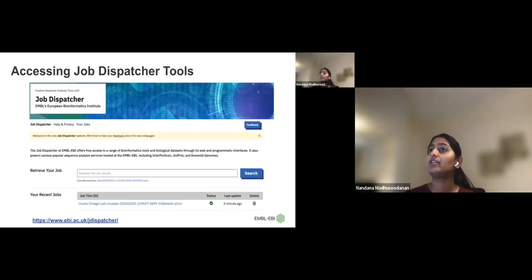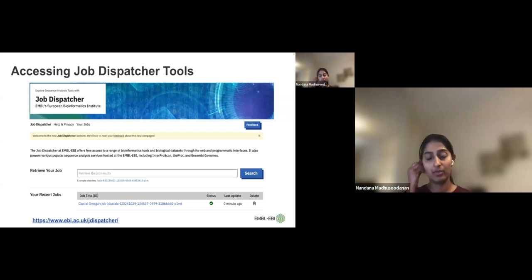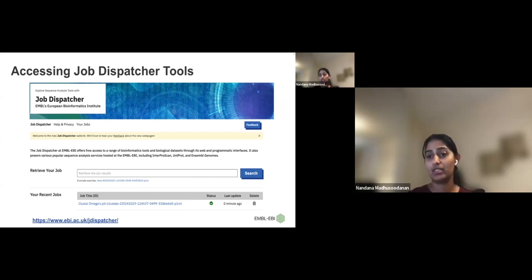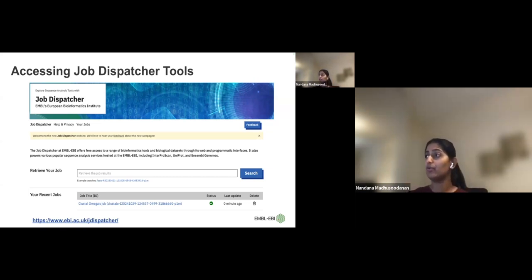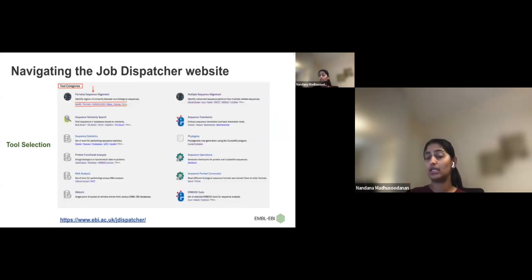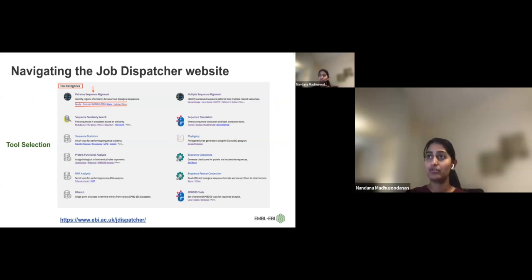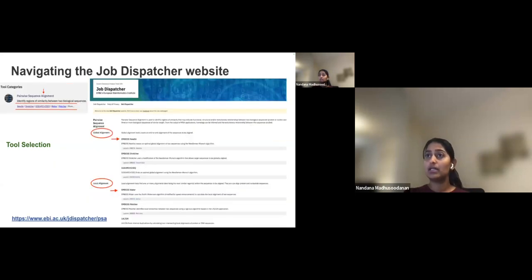This year we launched our new website, which you can access at www.ebi.ac.uk/jdispatcher. On the homepage, if you scroll down you can see different tool categories and tool names, making it easy for you to navigate through different tool sections.